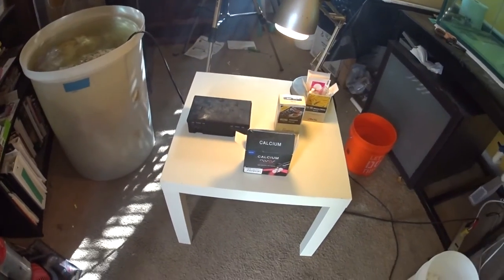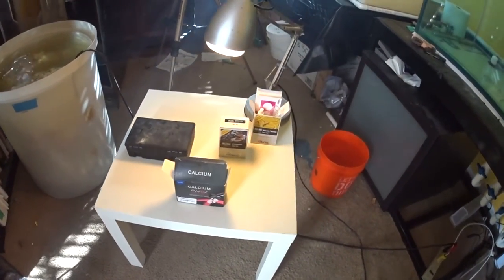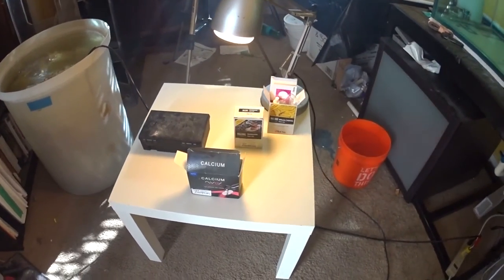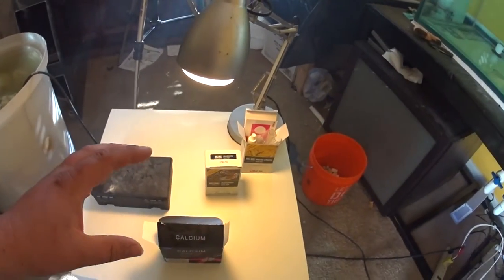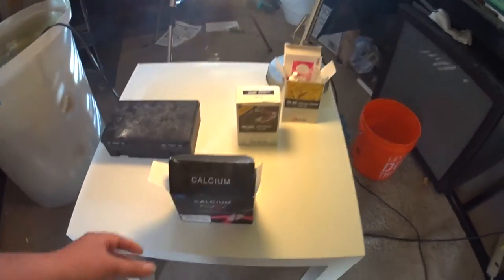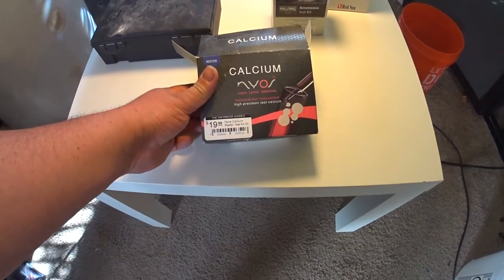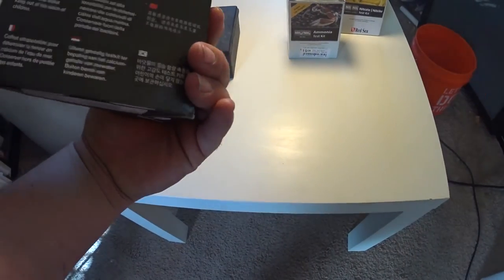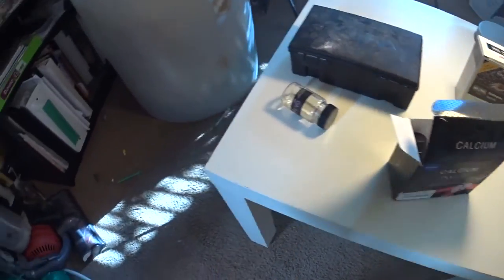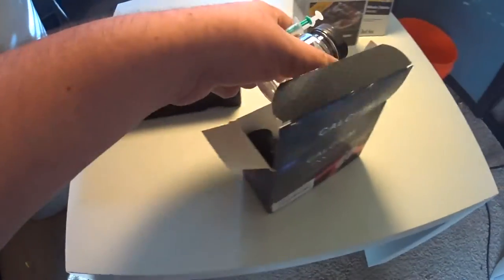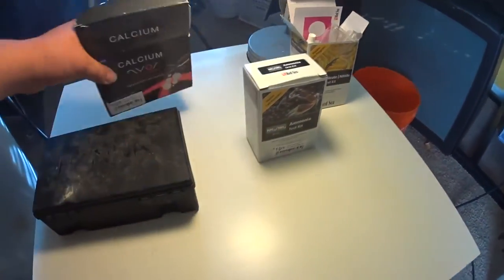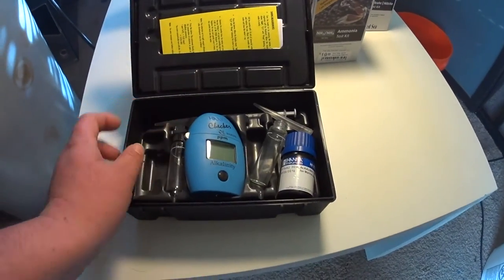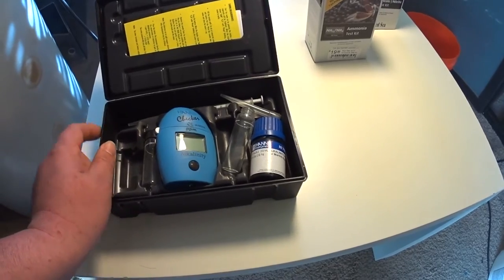I probably should, so right now I don't know where my tank is, so I figured I would show you guys the equipment or the test kits that I use. For my calcium, I use the NIOS calcium test kit - it's very easy to read. And then for my alkalinity, I absolutely love the HANA checker alkalinity test. Any test kit is hard for me to read, so the digital HANA checker is fantastic.